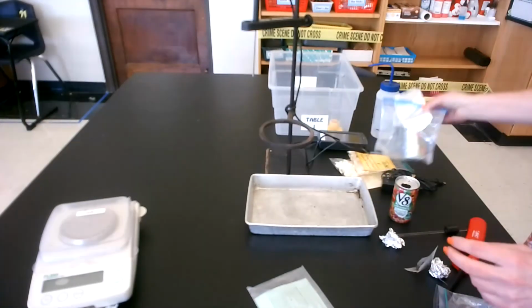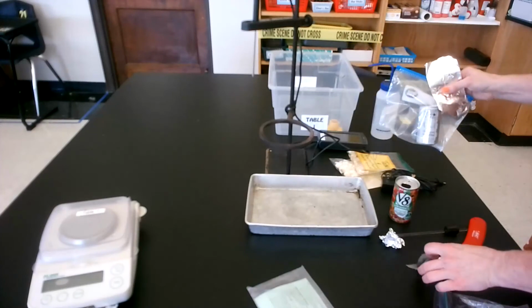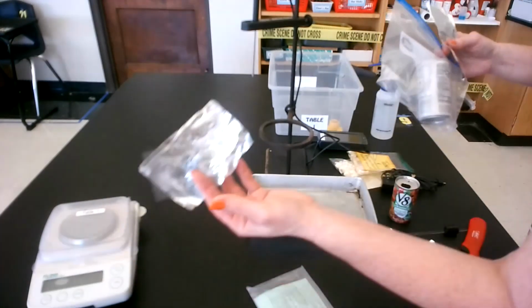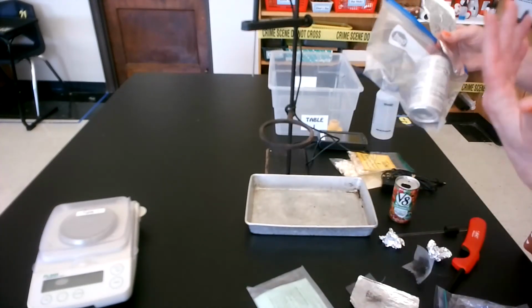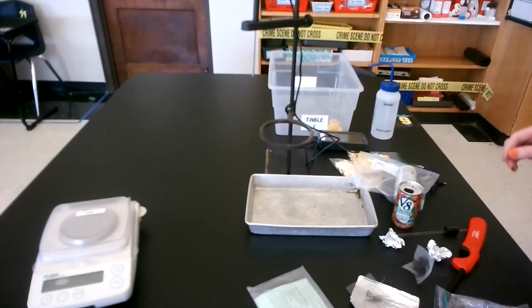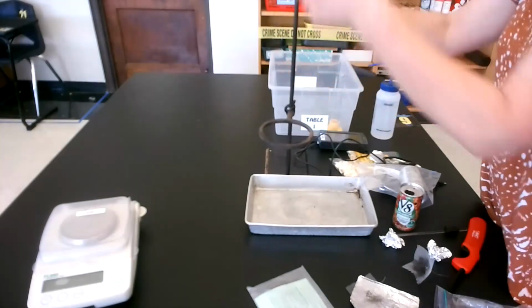Then I will do everything I just did for my second food. I will construct my new food holder with new foil, new paper clip, new screen, find the mass, and do everything I just did except with my second food sample. So if you do have any questions, make sure you take a look at this, you understand this, and then clean up. When you clean up, you're going to take all of this apart.